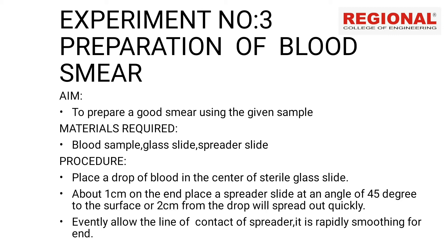We are going to prepare a blood smear using the given sample. We are going to use the materials required: blood sample, glass slide, spreader slide, and the preparation nearby.